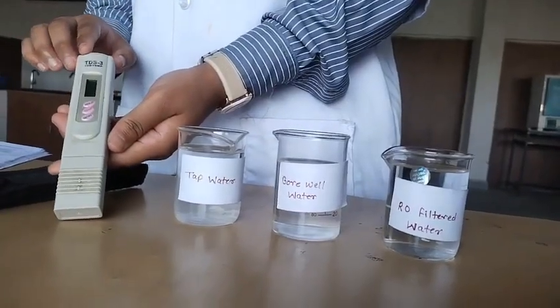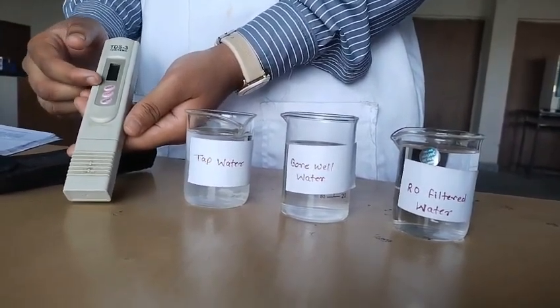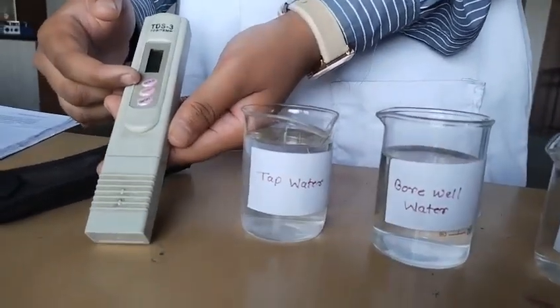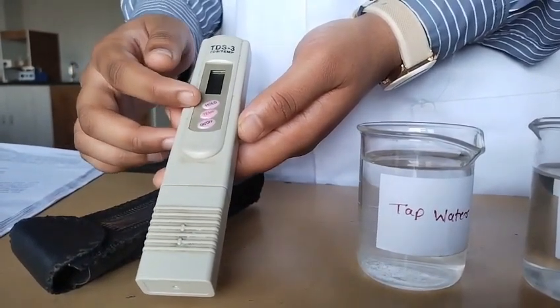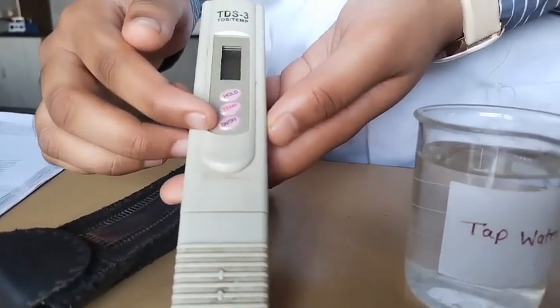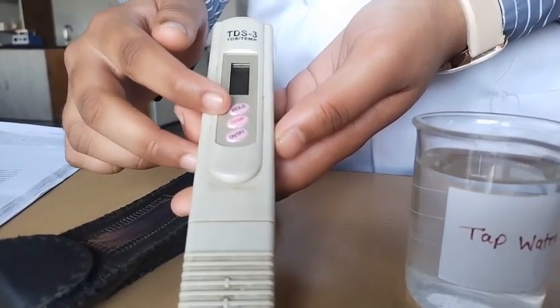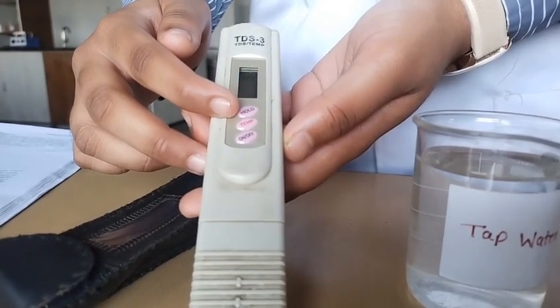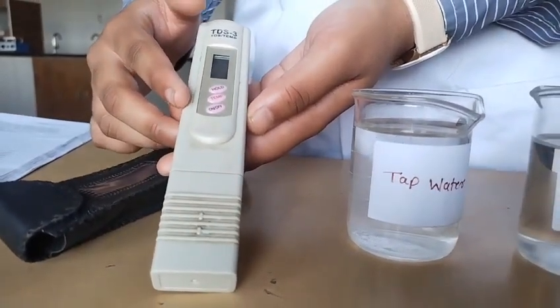This is a TDS meter. TDS meters are widely used because they are simple to operate. It consists of a readout screen which displays TDS in ppm. There are 3 buttons on the meter. The on-off button is used to turn the meter on and off. The temperature button is used to measure the temperature of water. The hold button is used to freeze the reading when the metal probes are in contact with water. This helps to note down the reading once the meter is removed from water.